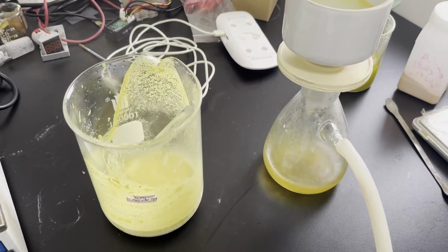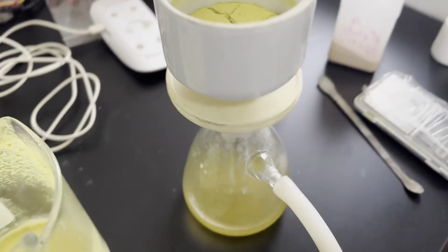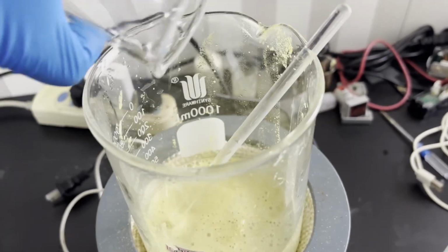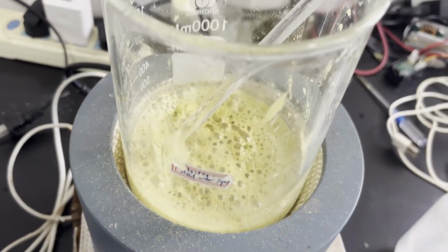After the 5 minutes of boiling, the mixture is suction filtered to isolate the insoluble acridone from most of the sulfuric acid. The resulting filter cake is transferred back to the beaker, and a dilute sodium carbonate solution is added. The mixture foams quite a lot as residual sulfuric acid is neutralized by the carbonate.